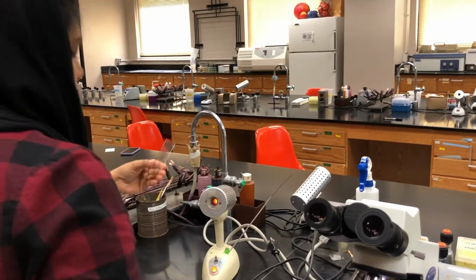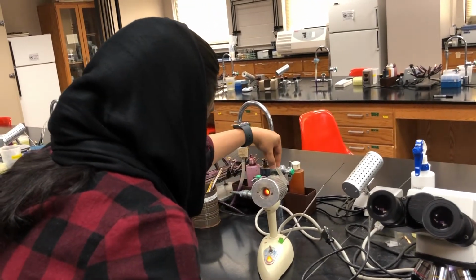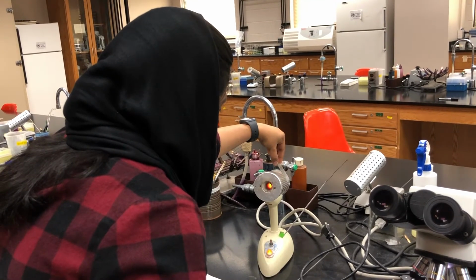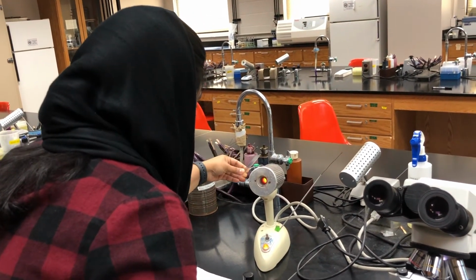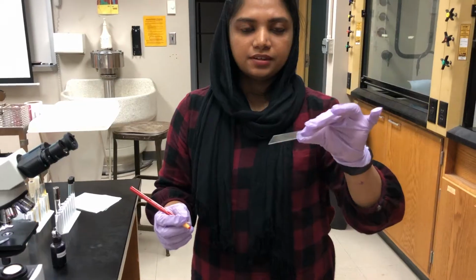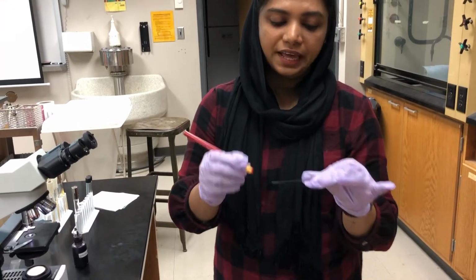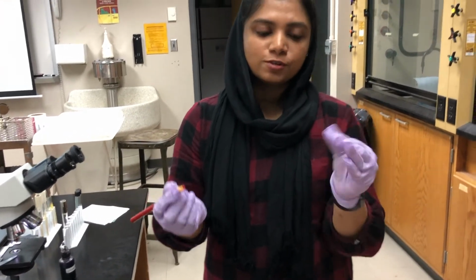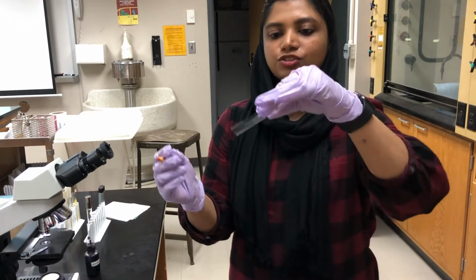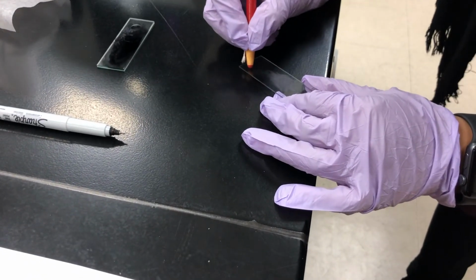For heat fixing, I'm holding the slide near the incinerator, keeping it like this for some time. For 30 seconds, I could count with the timer. Yeah, for like 30 seconds. It's been heat fixed, and now I'm going to put the dye. Before that, you need to label. You guys might be confused about which side has the actual cells, so you should label it with the wax pencil. So I'm going to label here like M.